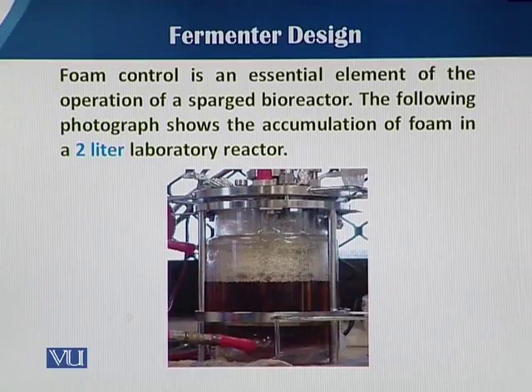Depending upon the nature of the medium, foam will be produced. As you can see in this picture, the head space is totally filled by the foam. This is just an example of a 2-liter laboratory reactor.